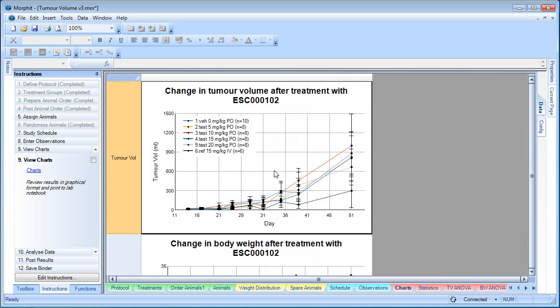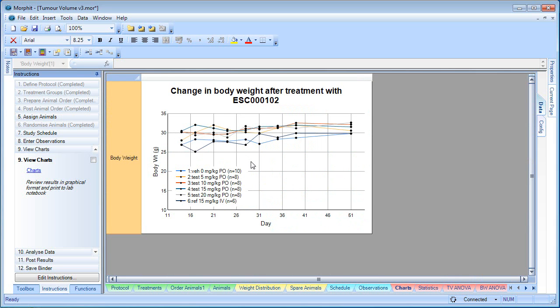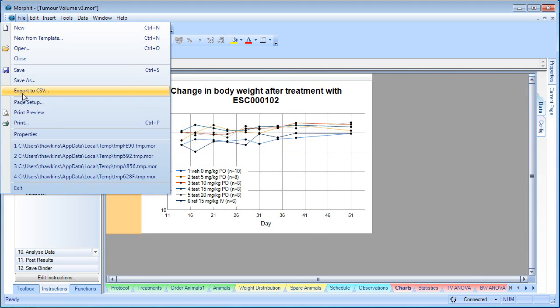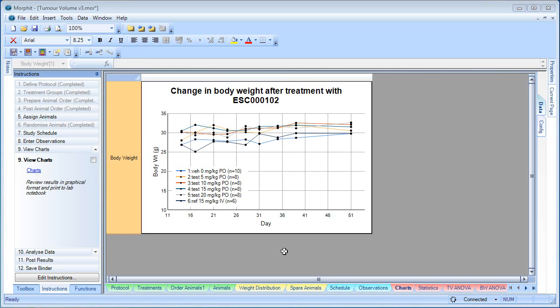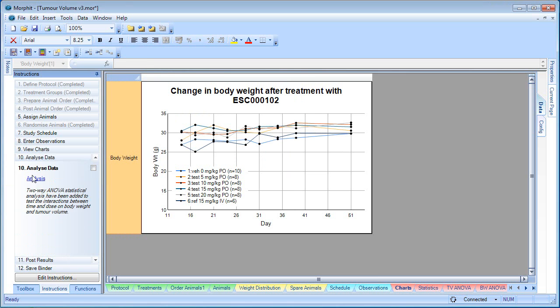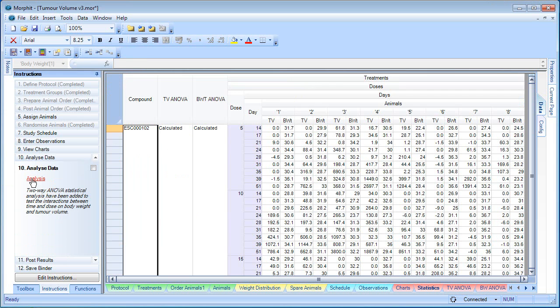This is the change in tumour volume, and this is the change in body weight. And if we like it, we can print this to BioRails. And this has just printed the page to the BioRails experiment.